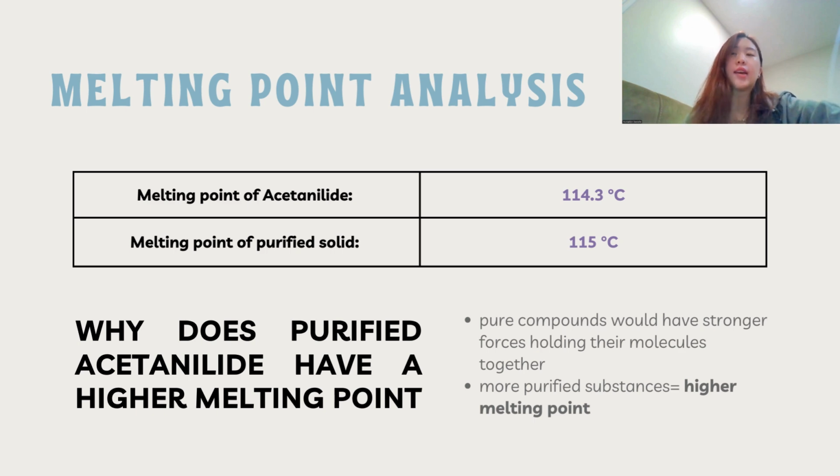Why is that? It's because when a substance melts, it doesn't happen exactly at the same temperature as its pure form, because the process isn't perfectly balanced. However, the temperatures are usually very close, usually differing by less than a degree Celsius. Acetanilide has a lower melting point when it has impurities mixed in, but when these impurities are removed by boiling, acetanilide becomes pure and the melting point becomes high.